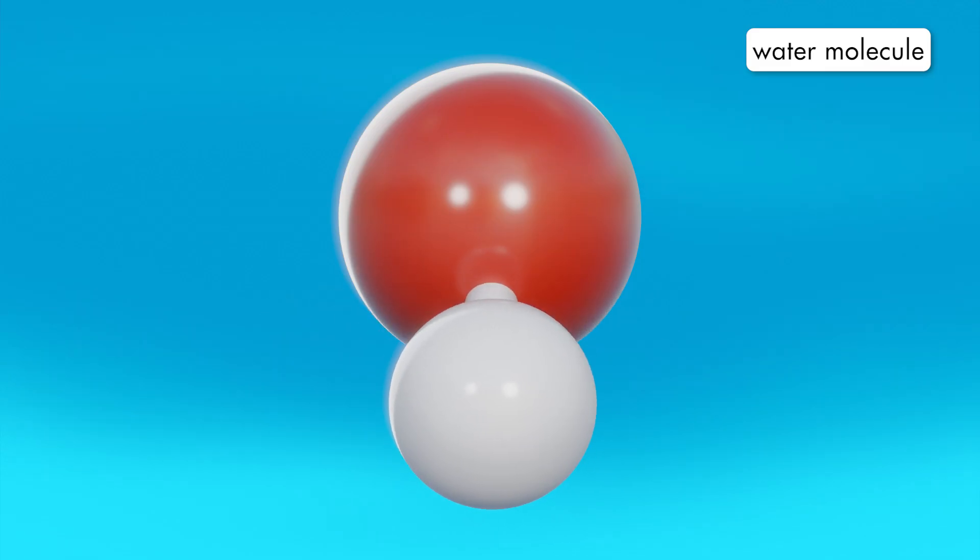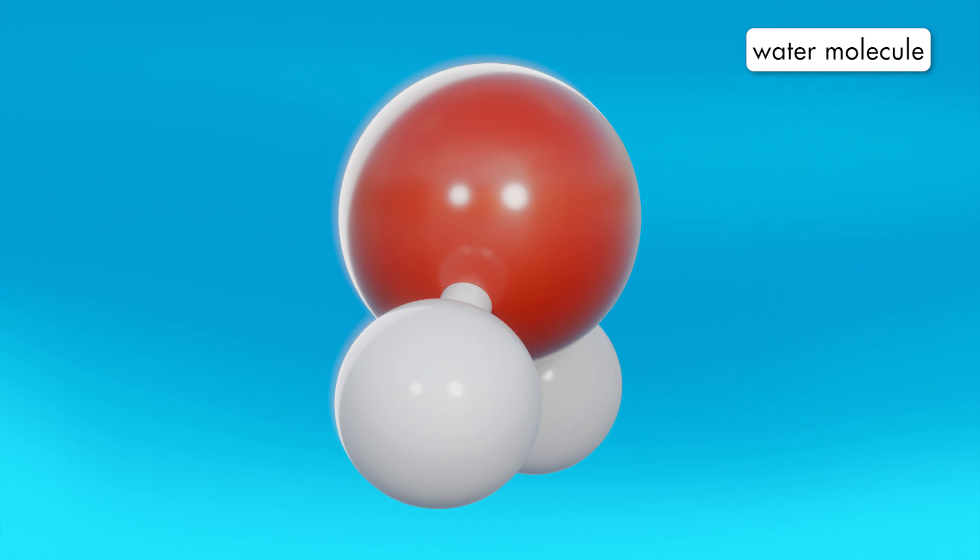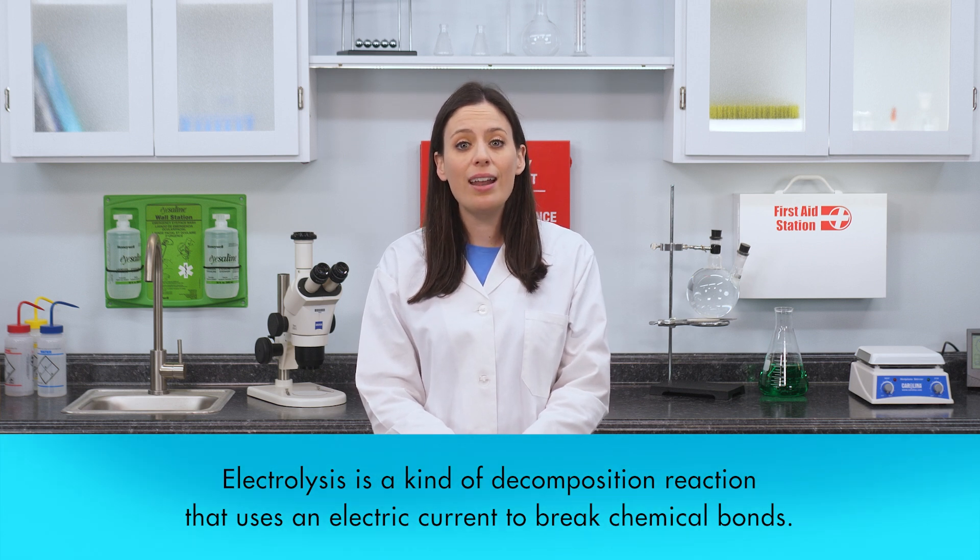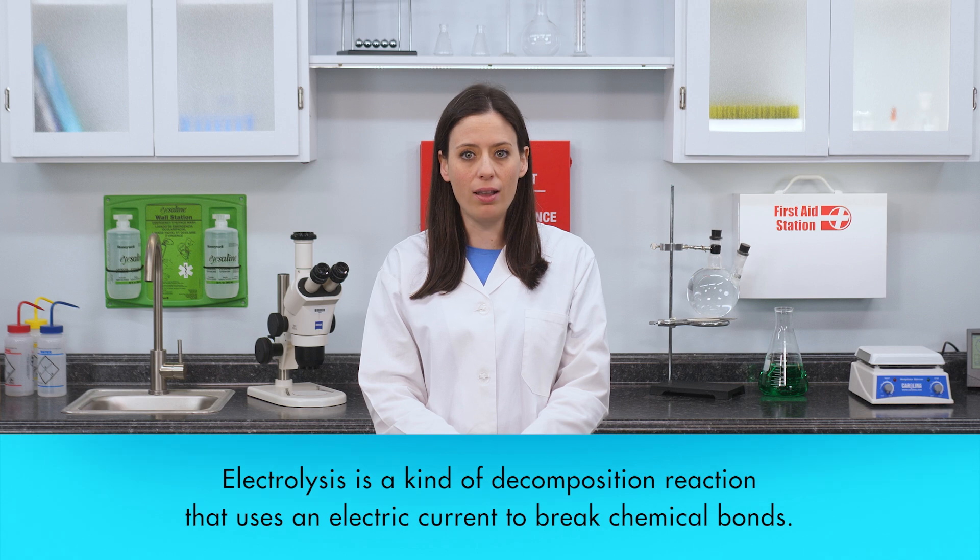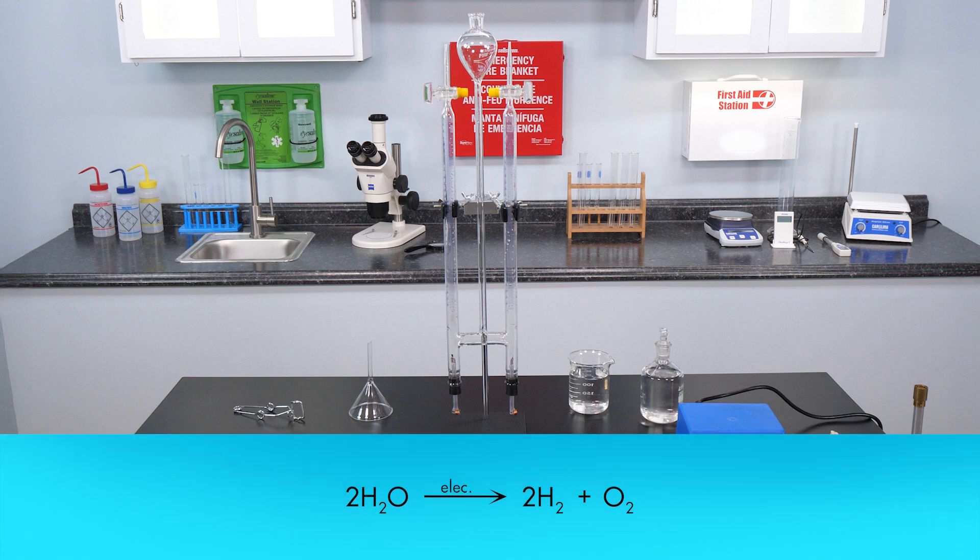Sometimes, an electric current is needed for a decomposition reaction to take place. Water molecules can be decomposed into hydrogen and oxygen by the process of electrolytic decomposition, or electrolysis. Electrolysis is a kind of decomposition reaction that uses an electric current to break chemical bonds. In an earlier lab, we used electrolysis to decompose water into hydrogen and oxygen. The electrolysis of water was accomplished using this Hoffman apparatus. The chemical equation for the electrolysis of water is 2H2O yields 2H2 plus O2.